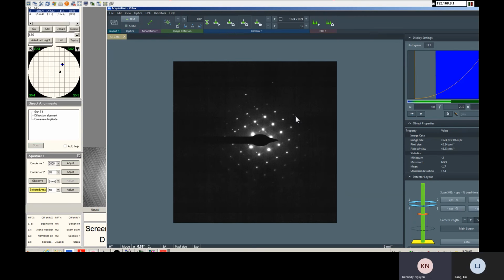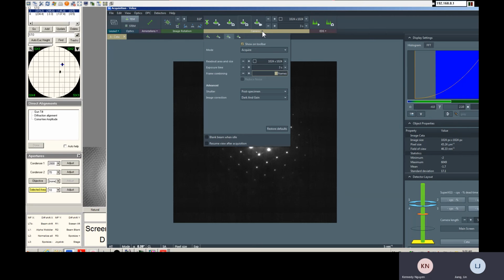Okay, it looks like we still need more, right? It should be solid. So let's go to 5 seconds, should be 100 frames.